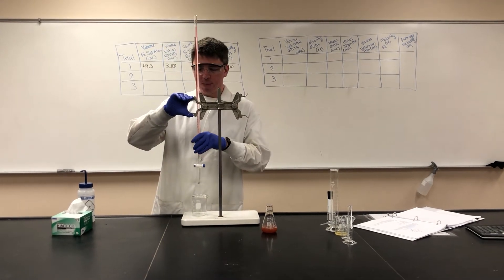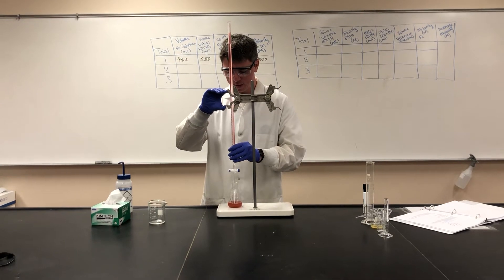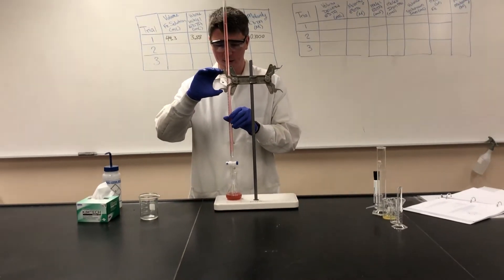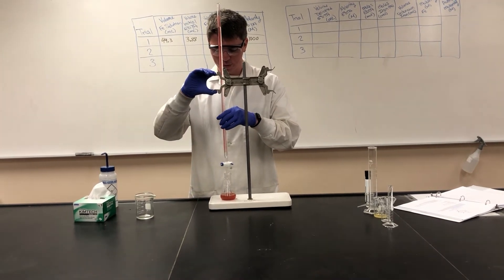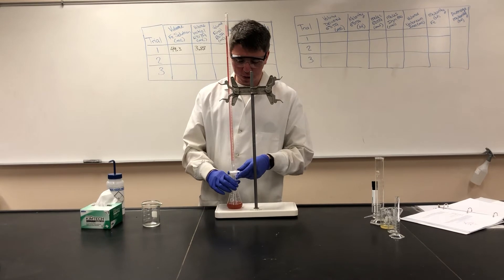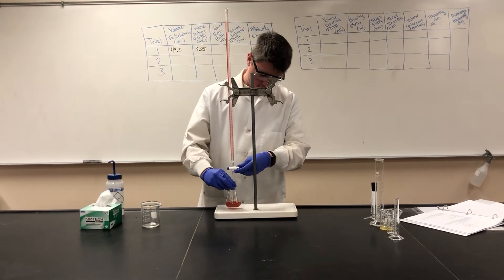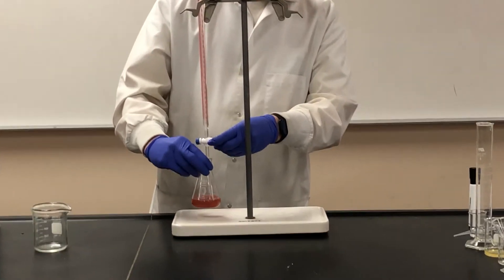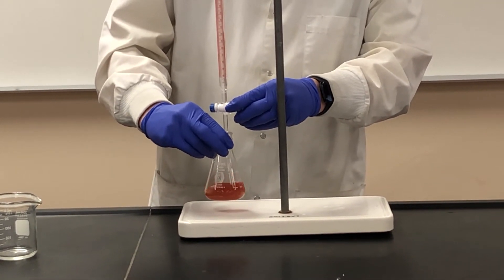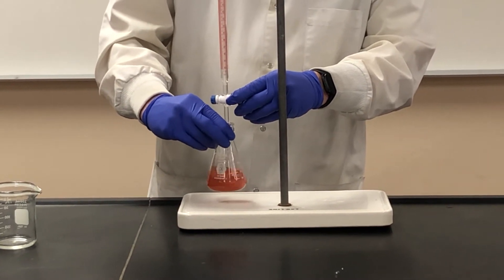At this point we can go ahead and begin our titration. We'll put our titration flask underneath our burette and slide just the tip of the burette into the Erlenmeyer flask — you don't want it touching the solution. Because I am right-hand dominant, I'll spin this around. You want to control the stopcock with one hand and be able to swirl your flask with the other. I'll turn this on until I'm just starting to see droplets come out, and be swirling the flask the entire time.